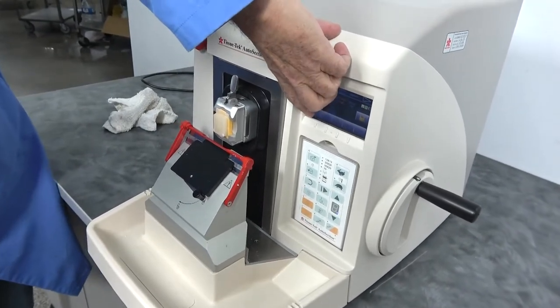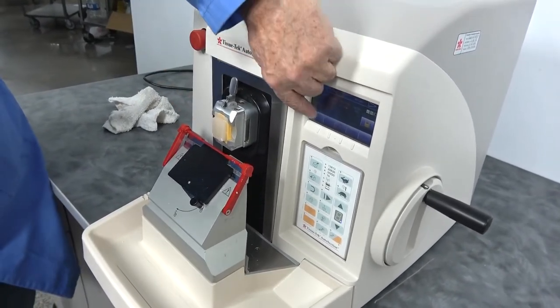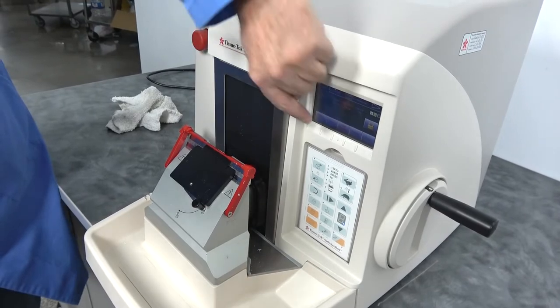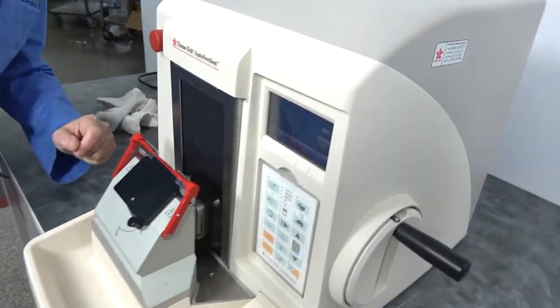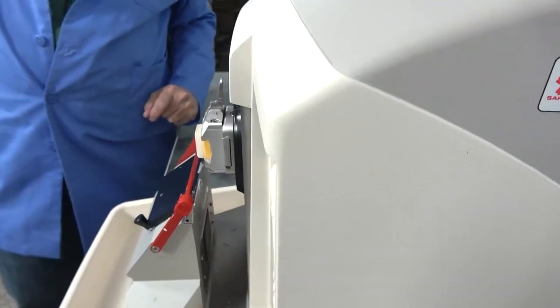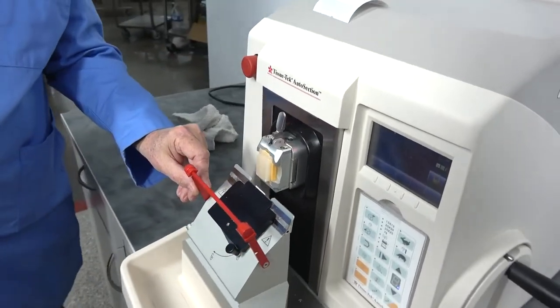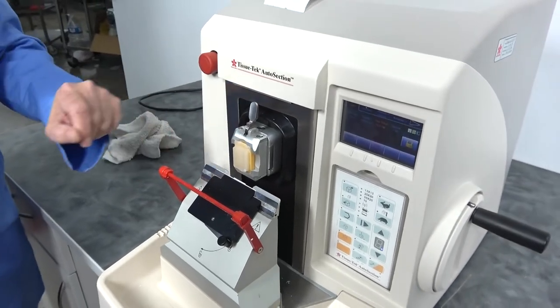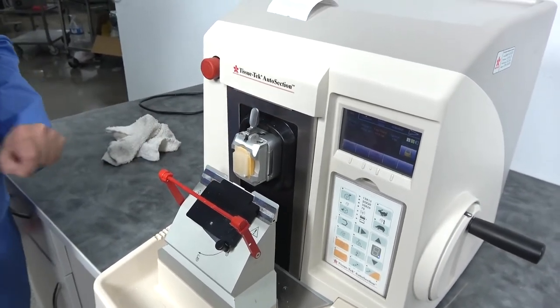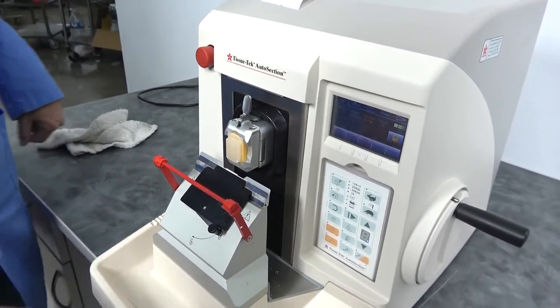It's going to start into facing this unit all by itself. It goes down and feels the face of that unit and begins the cut and begins sectioning or facing that unit. Now it's ready to section.